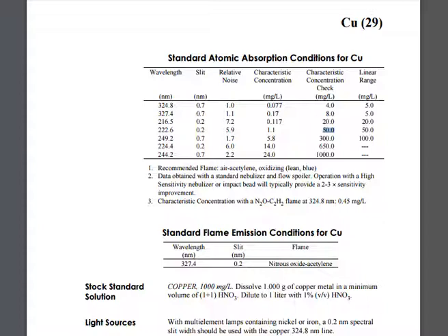If you go to quaternary, quaternary goes to 222. That calibration check is way higher to get the same type of signal. And because of that, the calibration curve can actually take a 50 part per million sample. That's where it's going to be linear.